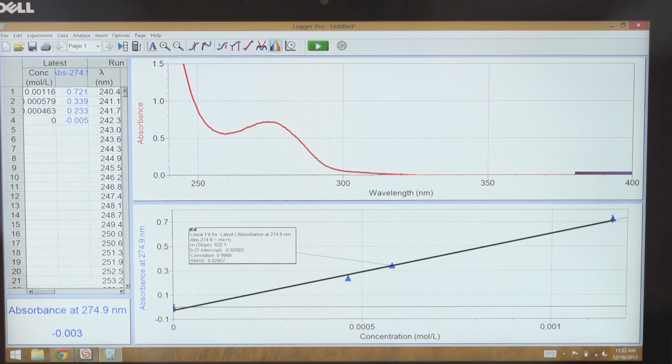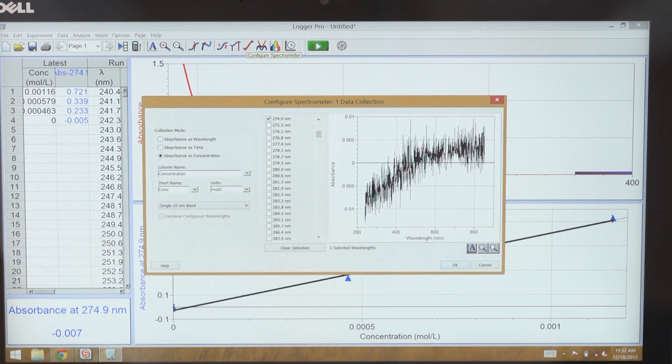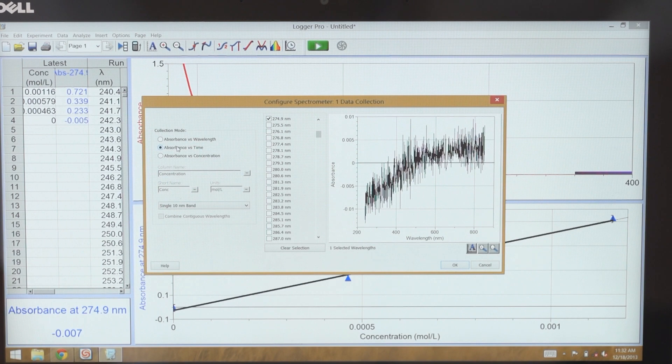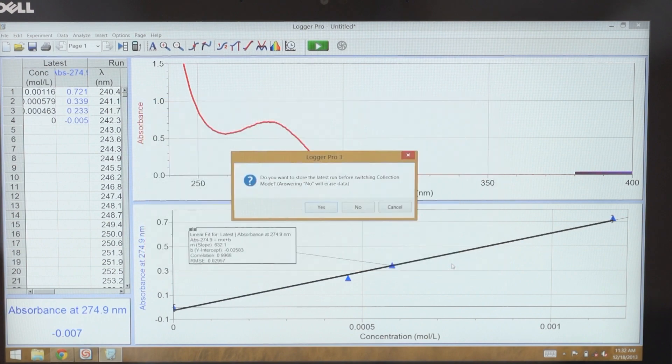If I want to do a kinetics experiment with this sample, I can go back to the configure spectrometer dialog box and select absorbance versus time. I can keep the same wavelength or select a new one. Select OK.